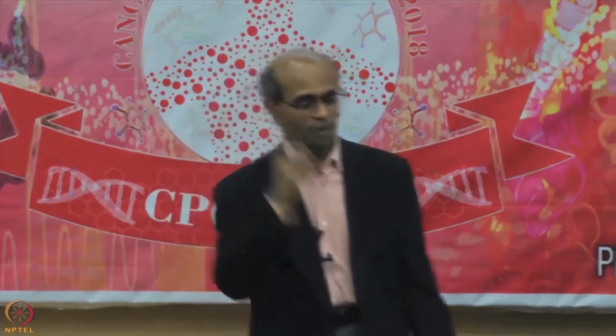So this is just to have fewer proteins in the analysis, but you'll still have about 7,000 proteins in your analysis. Then the question is, what kind of a test do you want to do? Do you want to do a 1 sample test, a 2 sample test, or a moderated or an F test? So here I'm going to pick 2 sample and then I'll tell you why.